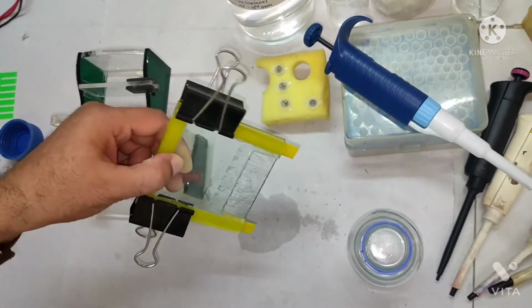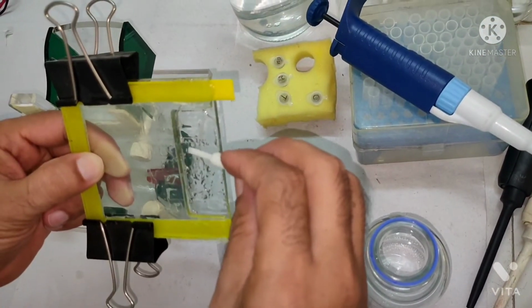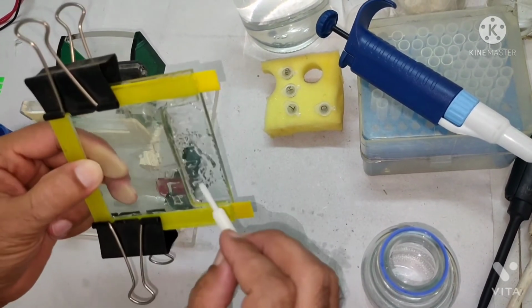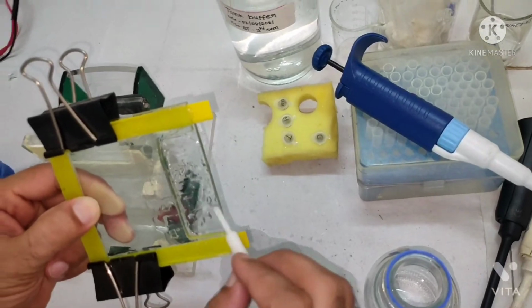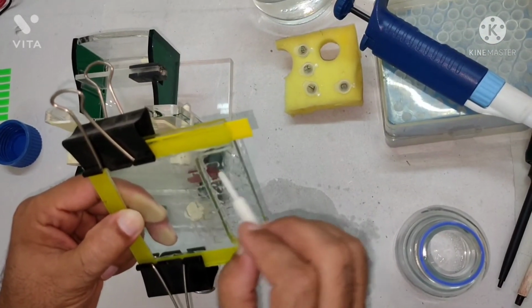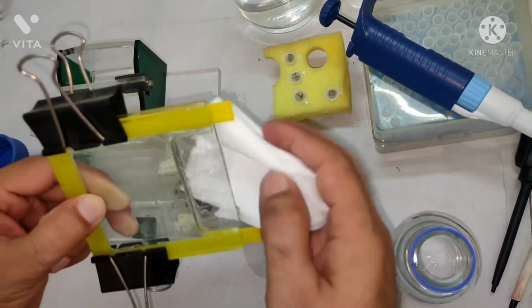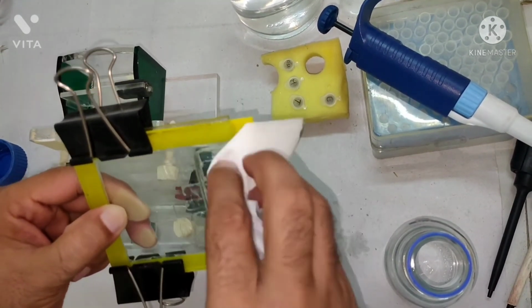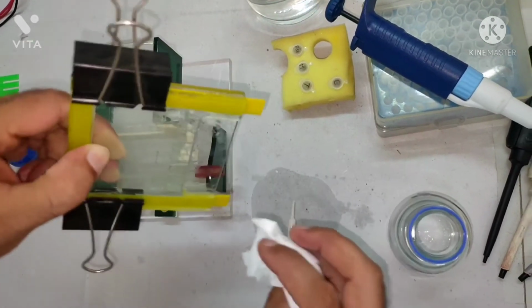See, this device is for making the wells clear, right? If something is stuck onto the, like, see, this is the gel which is already stuck to the glass plate, right? So you can clean, otherwise you will get some problem during the loading of your gel, loading of your samples, right? So you can clean it like this, okay?